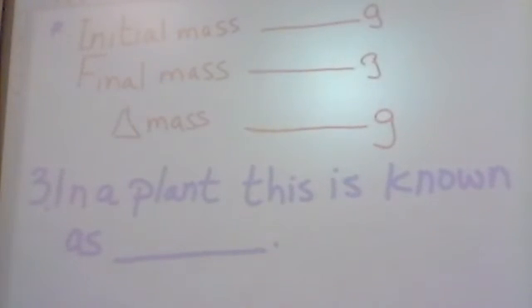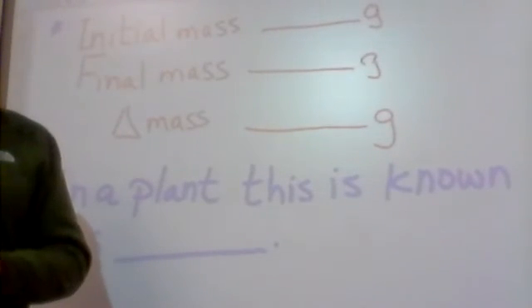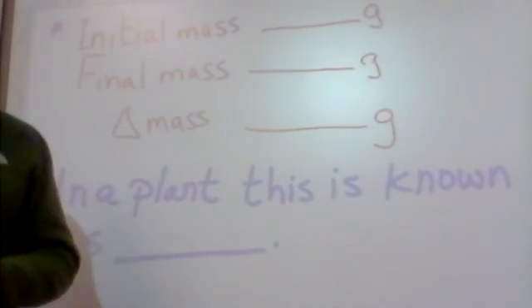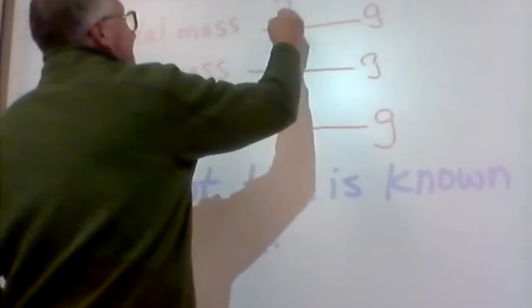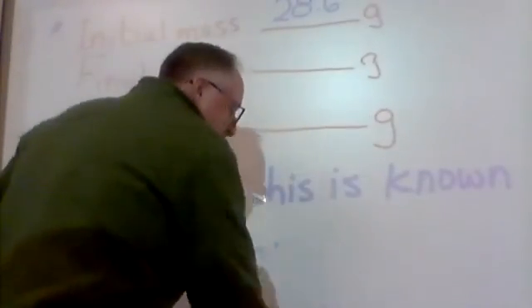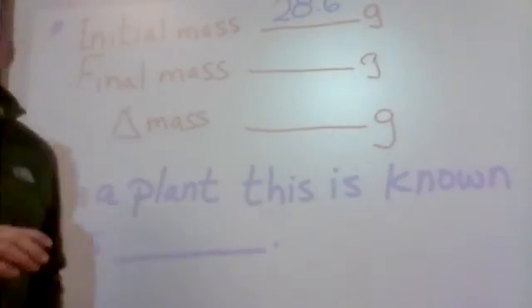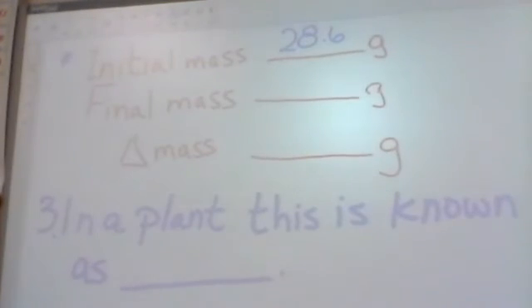Okay, and this is ABC. What was your original? Jane was the only one that got that, but she lost. No, I'm pretty sure it's 28.6. Where'd they go? 28.6, pretty sure. 28.6. Oh my, there's nothing like rock solid science. We have a leaking cell, we have a guess at a number.